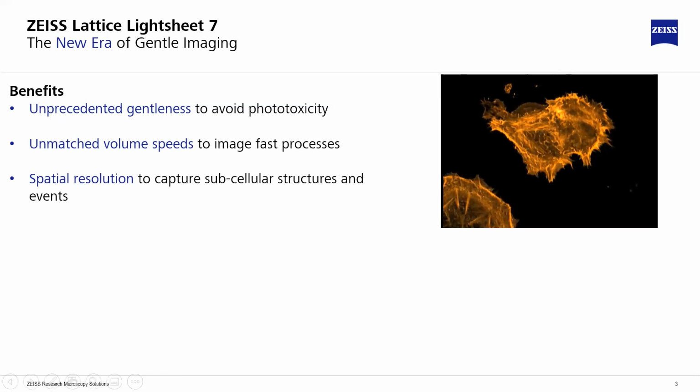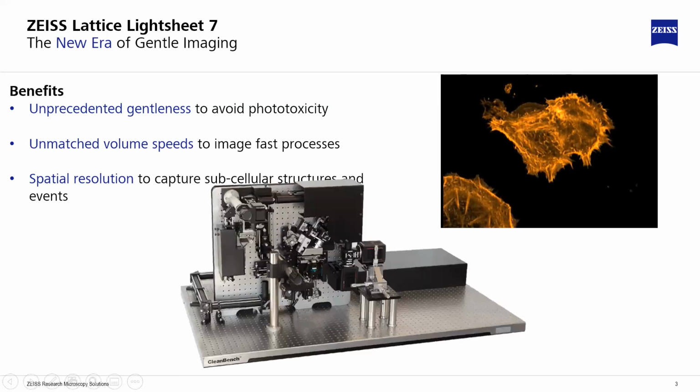So this here in the center of the screen is maybe a little bit more familiar to some of you, or is at least the initial implementation of a lattice light sheet microscope. I believe this is a photo of the Betzig system at Janelia, or one that's patterned immediately after that type of system. And initial implementations of lattice light sheet looked a lot like this.